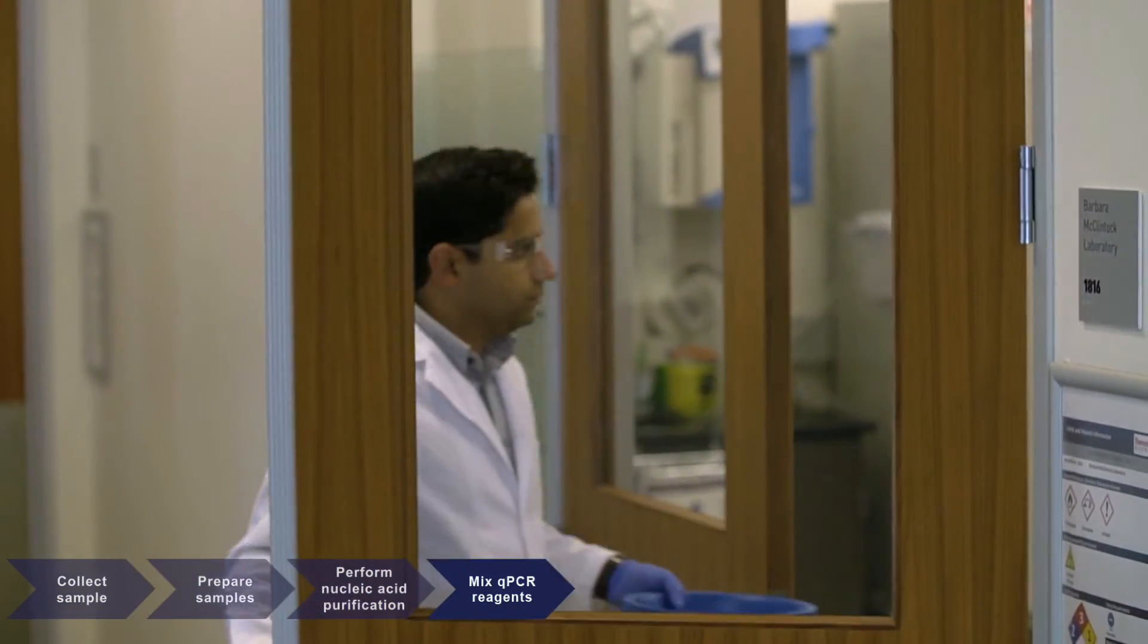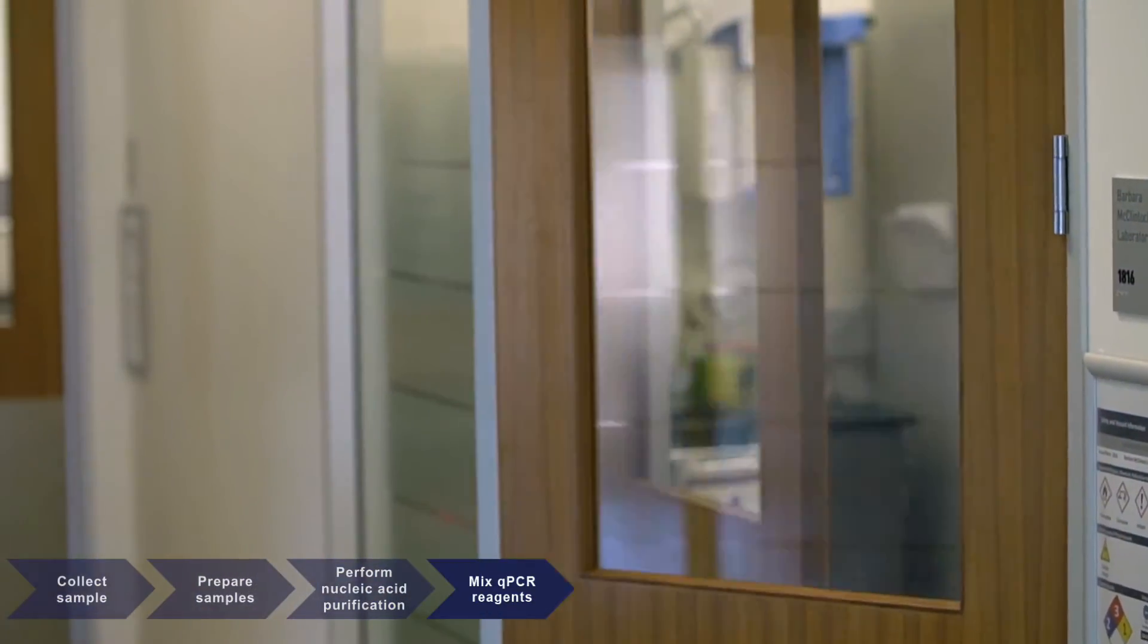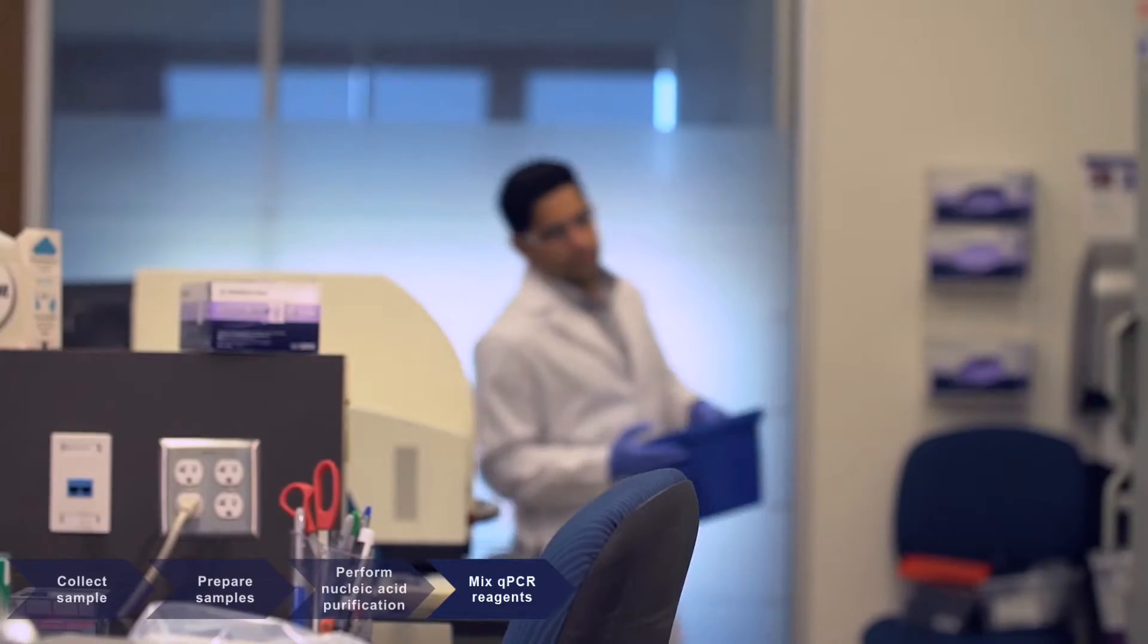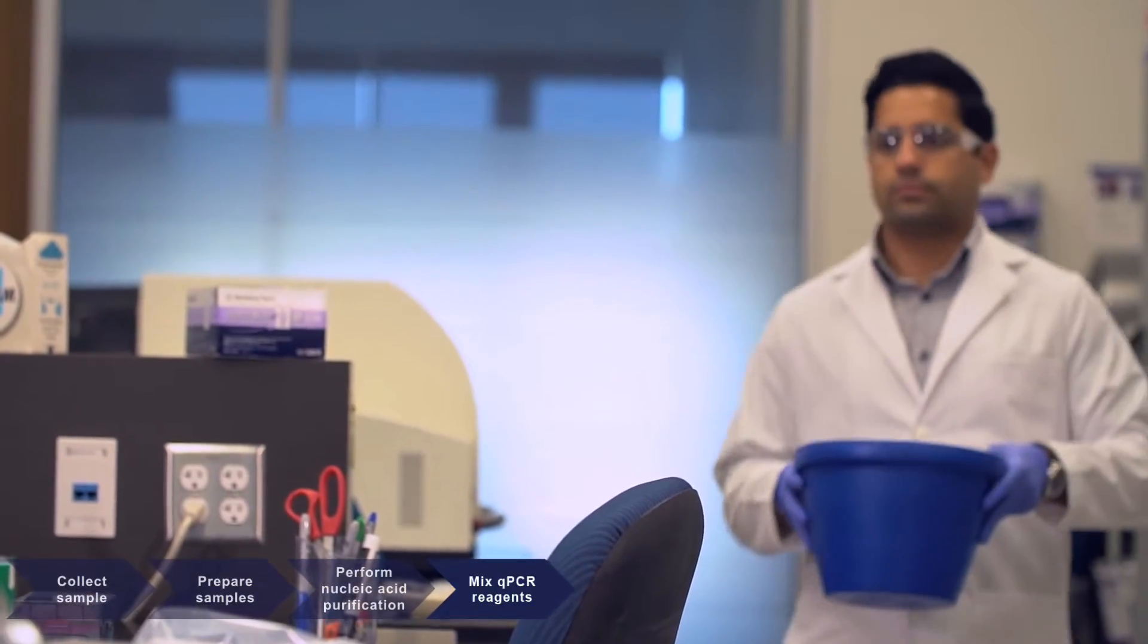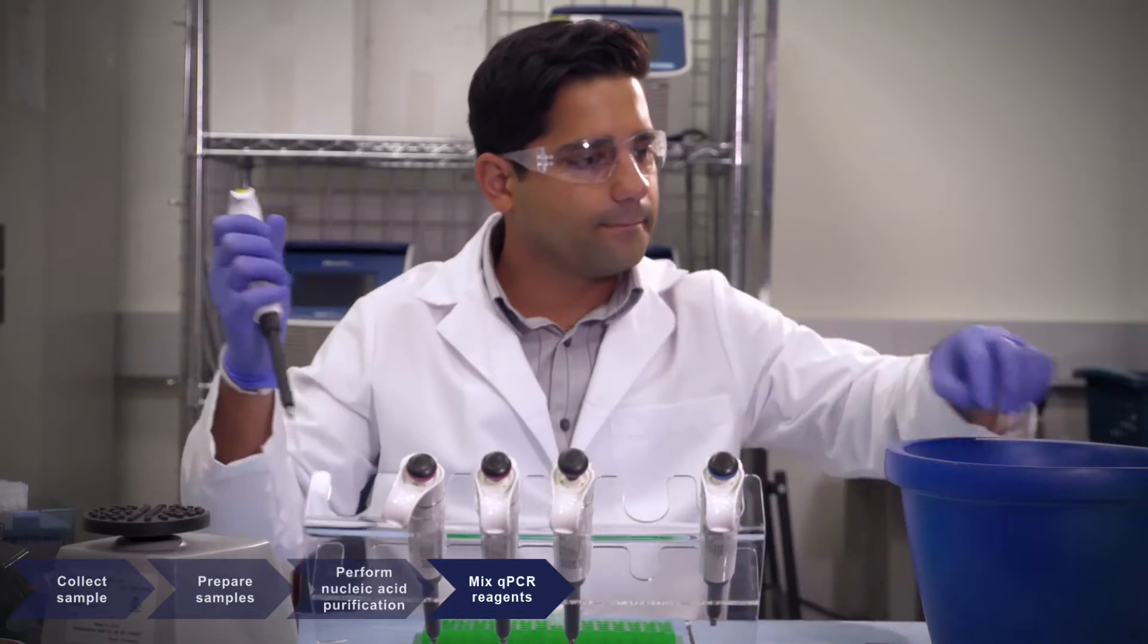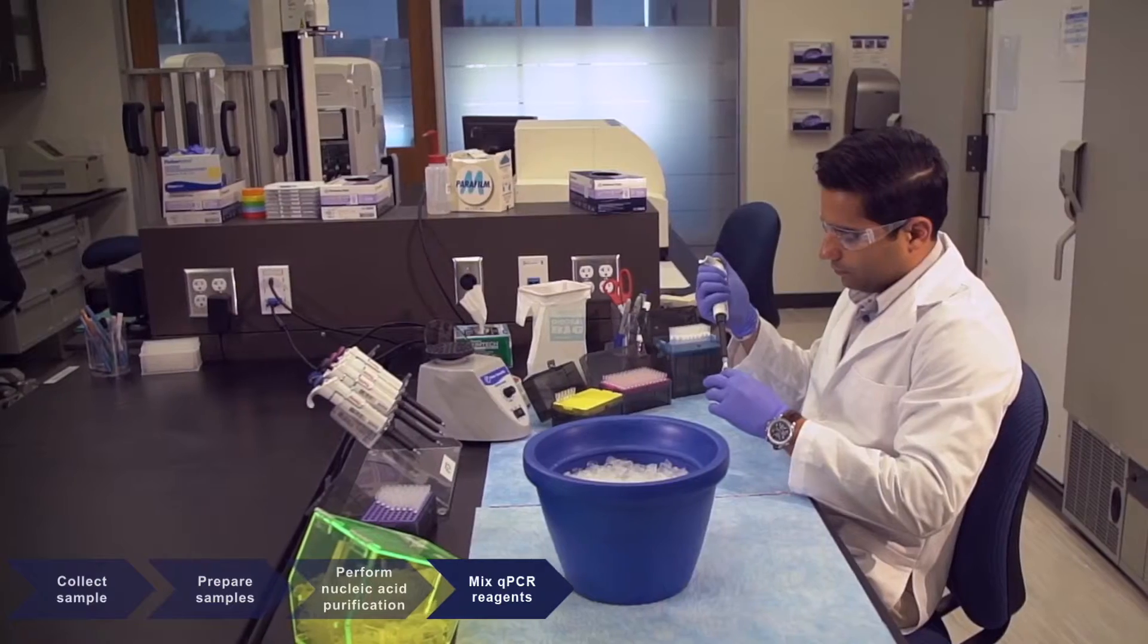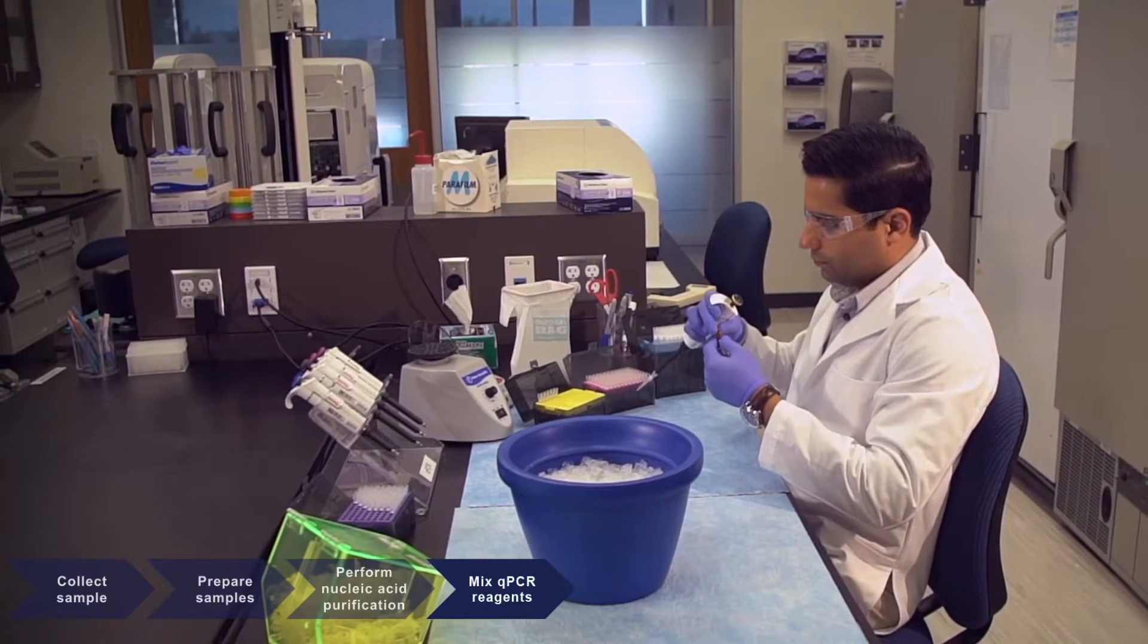Purified nucleic acid is combined with an assay designed for detection of the target pathogens. For laboratory-designed assays, this includes primers and probes, PCR controls, and a master mix, which includes the PCR buffer, enzyme mix, and nuclease-free water.